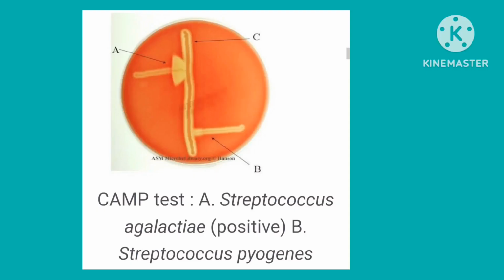After overnight incubation, we see an enhanced area of hemolysis at the area where the Staphylococcus and group B Streptococcus intersect. The hemolysis appears like an arrowhead. If hemolysis does not appear enhanced, the inoculated plate can be refrigerated. This is because beta hemolysins show a hot-cold phenomenon.